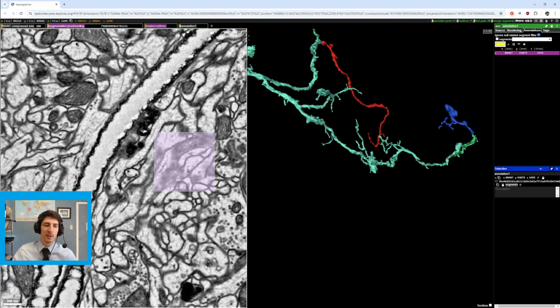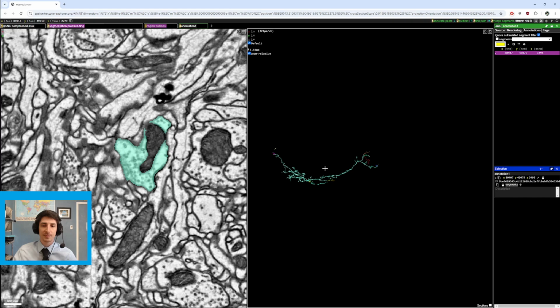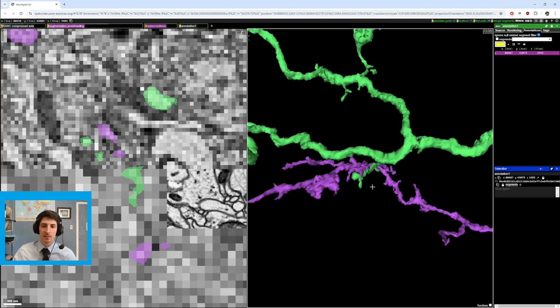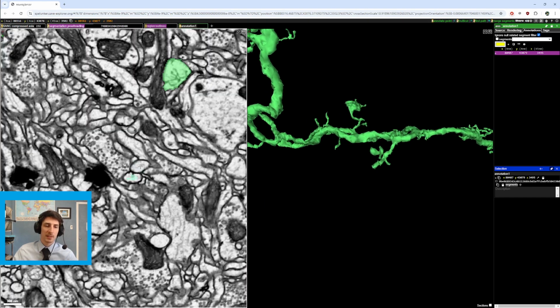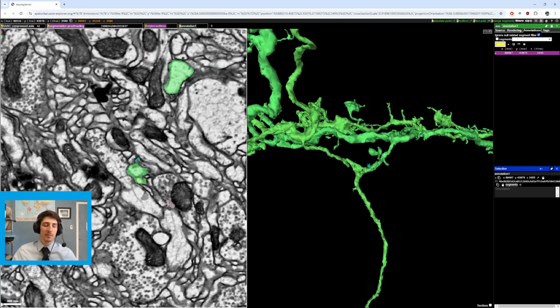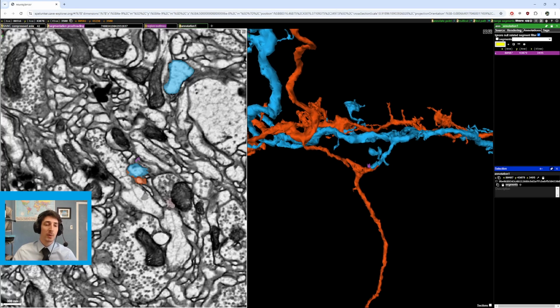But we have more activation over here in this area. And let's change the colors here. Get rid of that. This jump, and because there's a jump, that also tells me that it's likely that there will be errors over here.